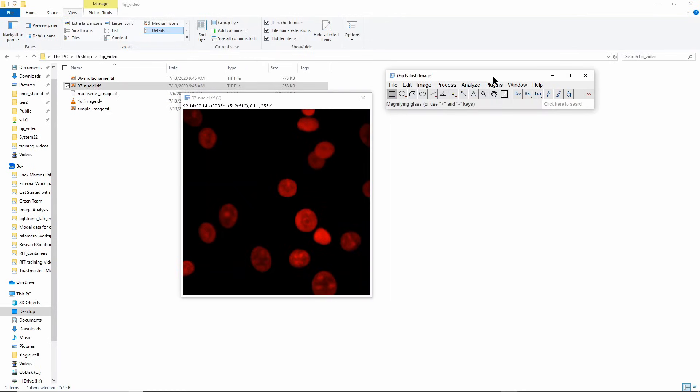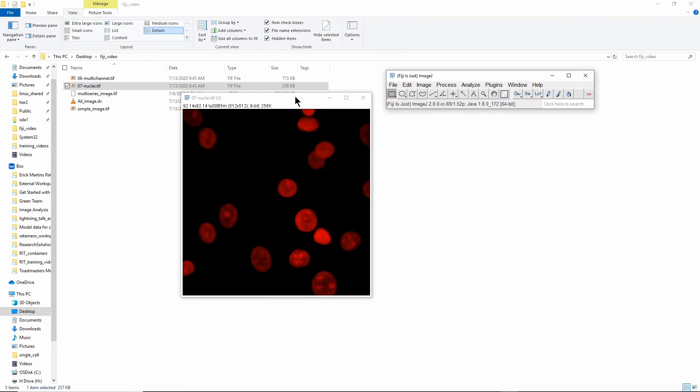So this is a very quick overview of very basic things that you can do in Fiji. Of course as I said, chances are if you have a problem in image analysis, someone has solved it using Fiji and there's a plugin somewhere to do more or less the thing you want. And because Fiji is open source, you can write your own plugins and add them to the environment.